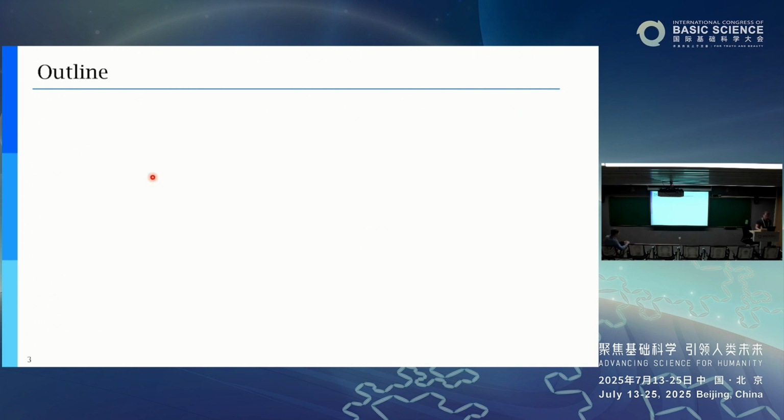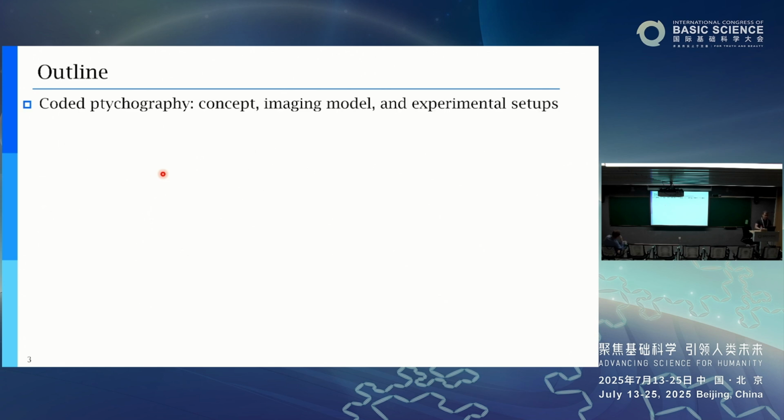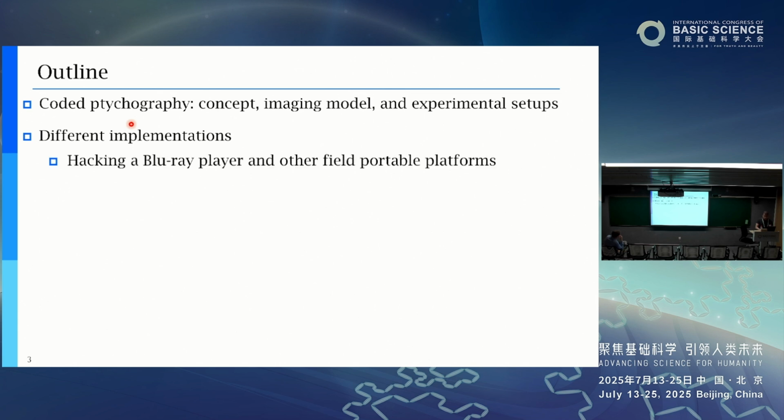So the outline of my talk: first, I want to talk about the concept, the imaging model, and the typical experimental setup for this ptychography technology. And I want to talk about different implementations. For the students, you can even hack a Blu-ray drive.